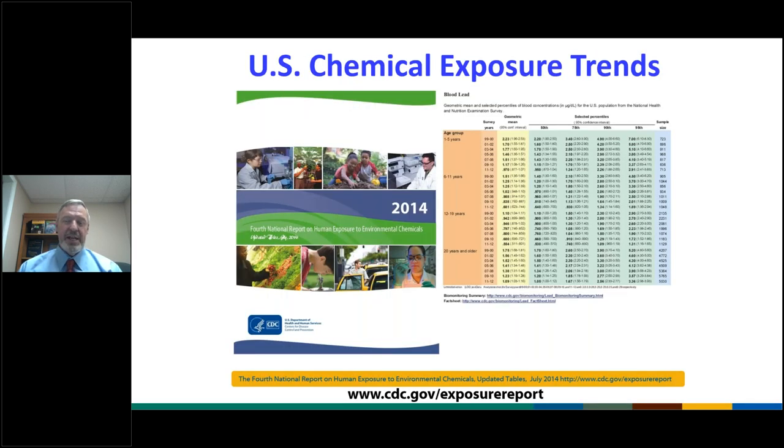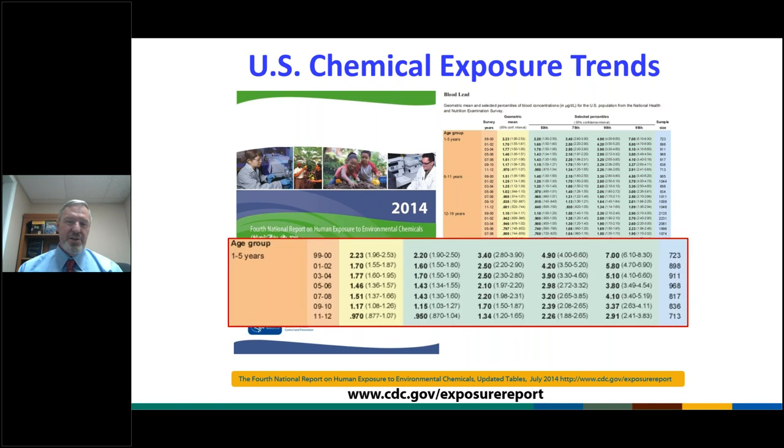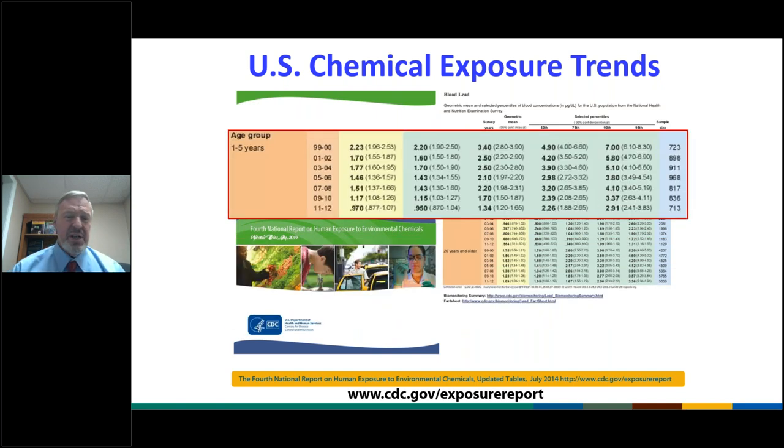The other thing you can look at is trends in the data. So in this example, you can look at the trends of an analyte in a population, say children, over time to see if your public health decision has had any impact. So in this country, I mentioned a little bit, when they reduced the level of arsenic in drinking water that's allowed, we had data before that policy went into place, during the policy transition, and then after that. So we could actually monitor that policy decision over time.